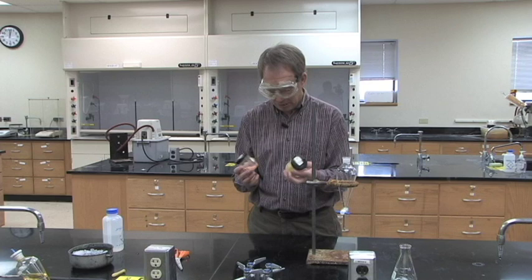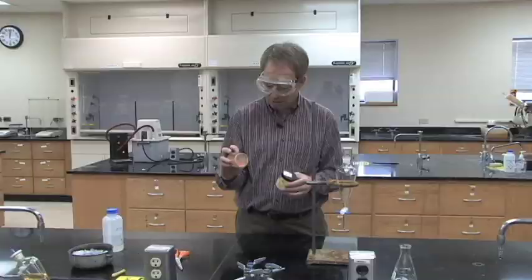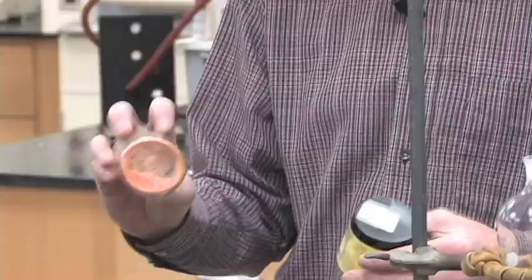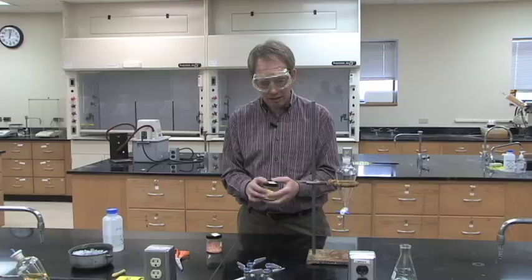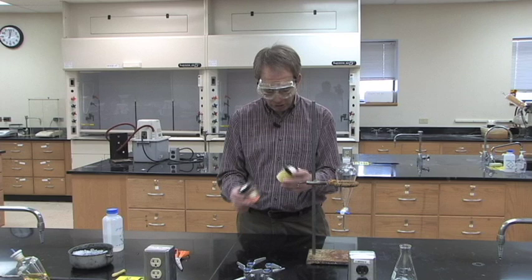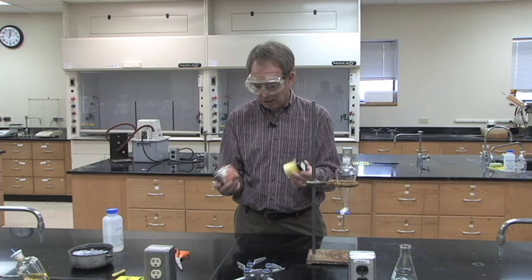In lab 4, everybody will be assigned an unknown. There are four different unknowns: two of them are orange with a white solid in them, and two of them are yellow with the white solid mixed in. What you will end up doing is separating out the two compounds from whichever unknown you have — one is the color you see in your unknown and the other is a white sample.